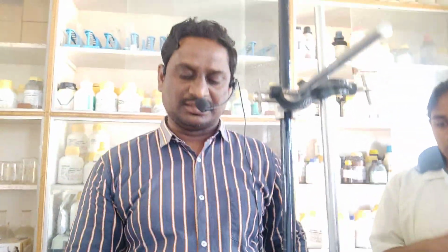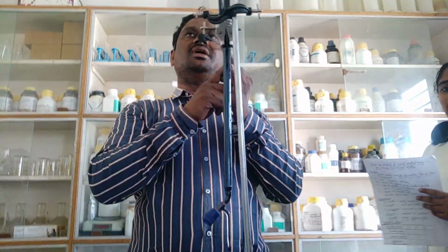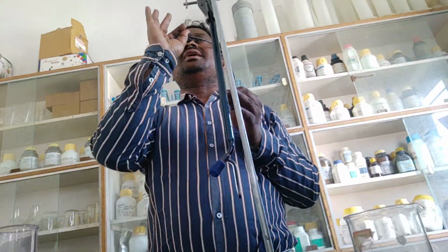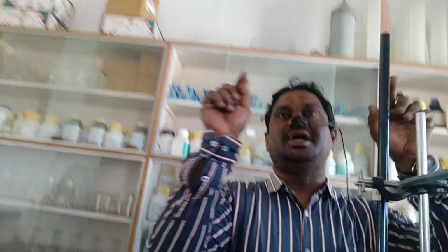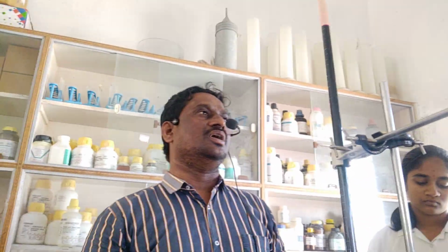Okay? Last phase, see. Finally you have to find the mean burette reading. Now we have to find the mean. We got the difference for the first, second, and third. 3 times we have got the readings. So you have to take the mean: first one plus second one plus third one, divided by 3. So you will get the value. This is the value of V1.